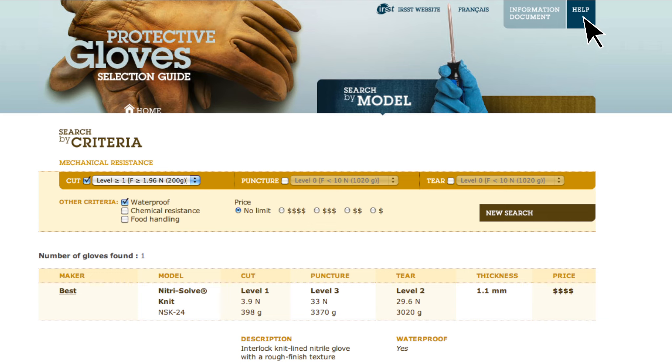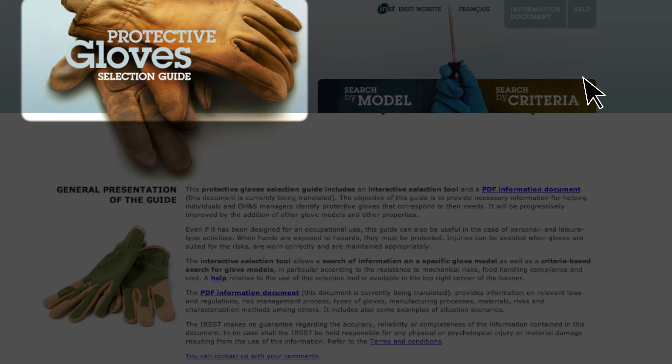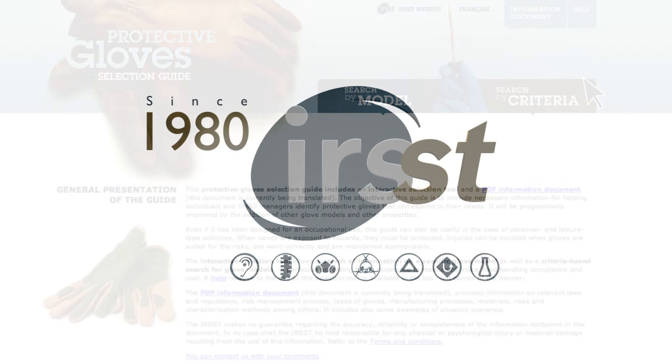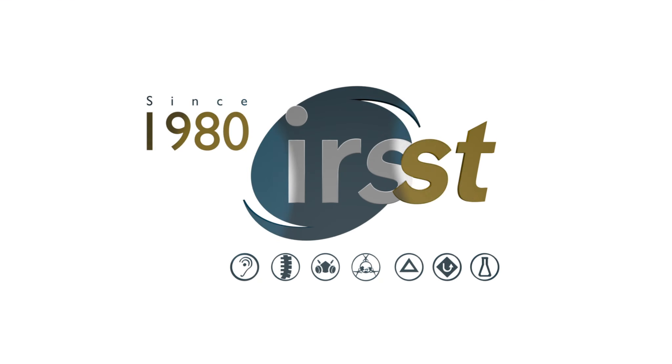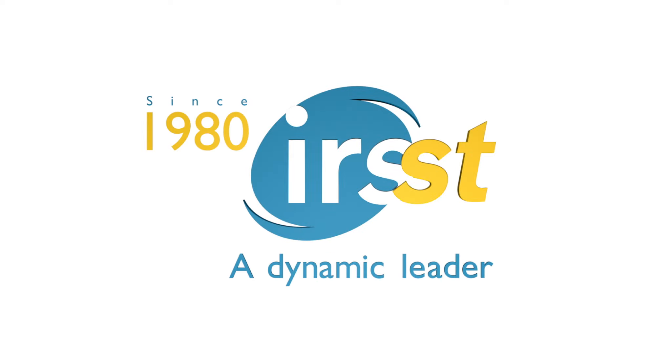A help function is always available as well as a return to the home page. Thank you very much for watching!